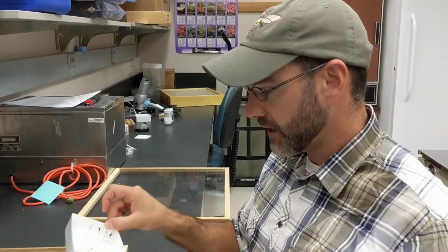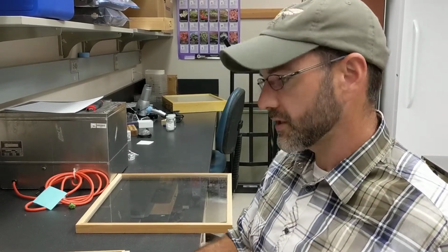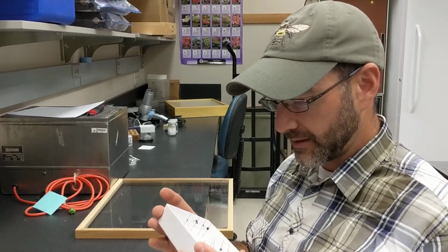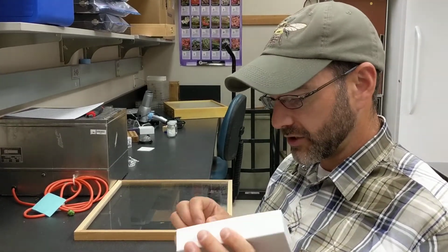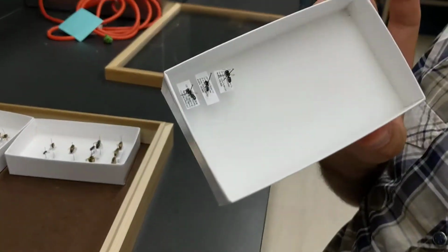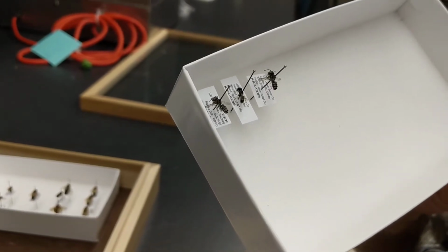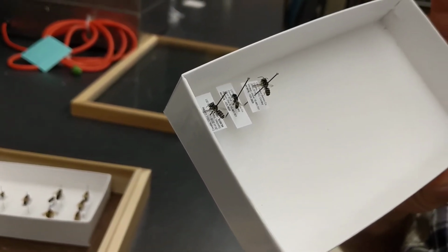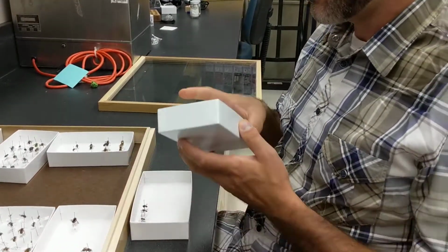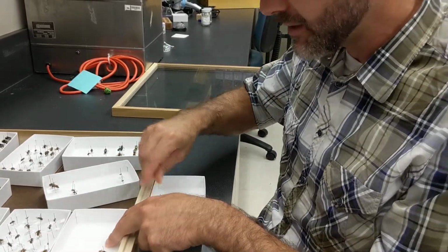Yes, I absolutely agree. This is something that you probably wouldn't use a microscope for. But of course, if it's right there, you can just slide over to the scope and confirm or reject your suspicions on various things. So right now, I'm pulling out these things. I'm going to pull out everything I think is a Megachilidae, so leafcutter bee family. And then we continue on. And this will be the first pass for the Megachilidae, so I'm going to pull out all the Megachilids.